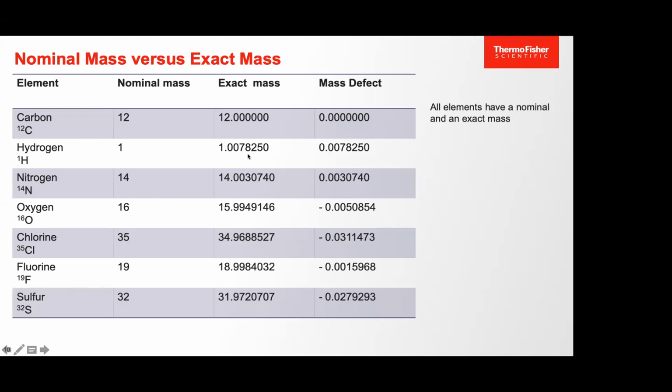You have a column called mass defect. For those of you who eventually want to move to a pharma company, discover drugs and understand how the drugs are going to metabolize in our body, then you need to know mass defect. So with paracetamol, when we consume it, why do doctors say that after 4 hours you cannot take the next pill?